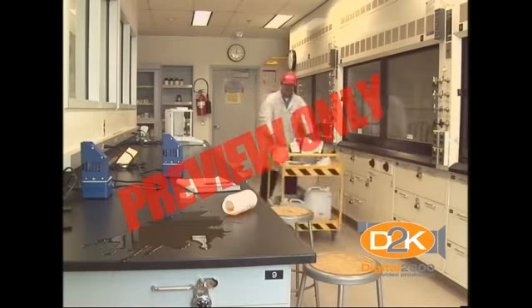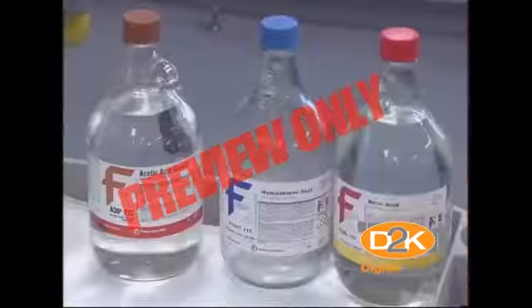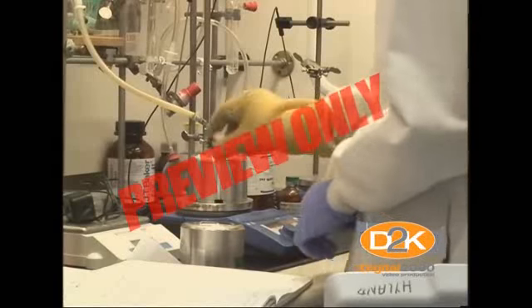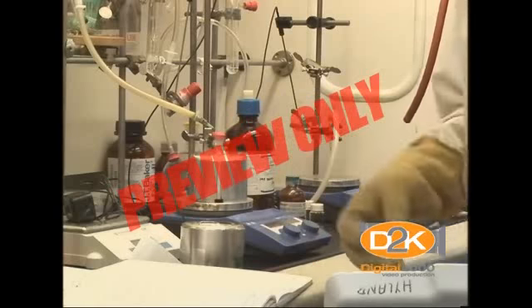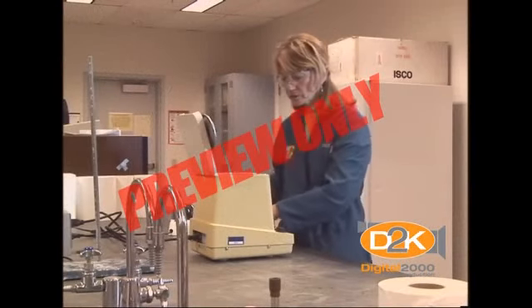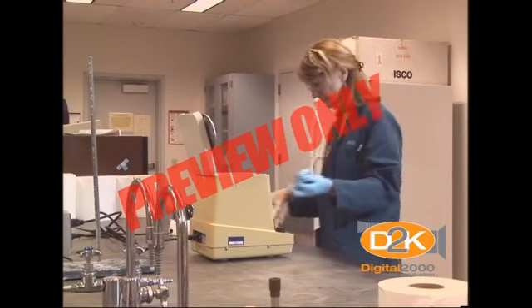Irritation to toxic substances may occur as a result of dermal, ocular, or inhalation exposure. Some common examples of irritants include ammonia, hydrochloric acid, halogens, sulfur dioxide, acetic acid, and formaldehyde. Chronic toxicity is characterized by adverse health effects as a result of repeated exposure to a low dose, typically below concentrations where acute effects are observed, over a long period of time. Carcinogens, reproductive toxins, and some solvents are examples of hazardous chemical substances that can cause chronic health effects.